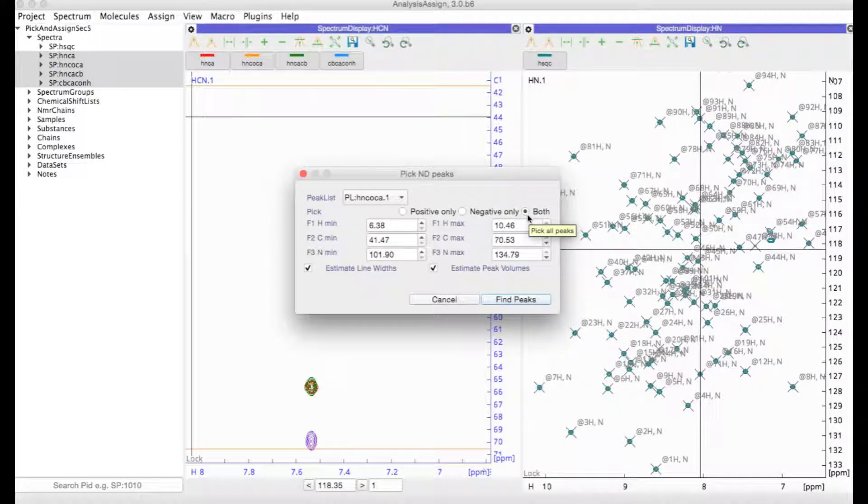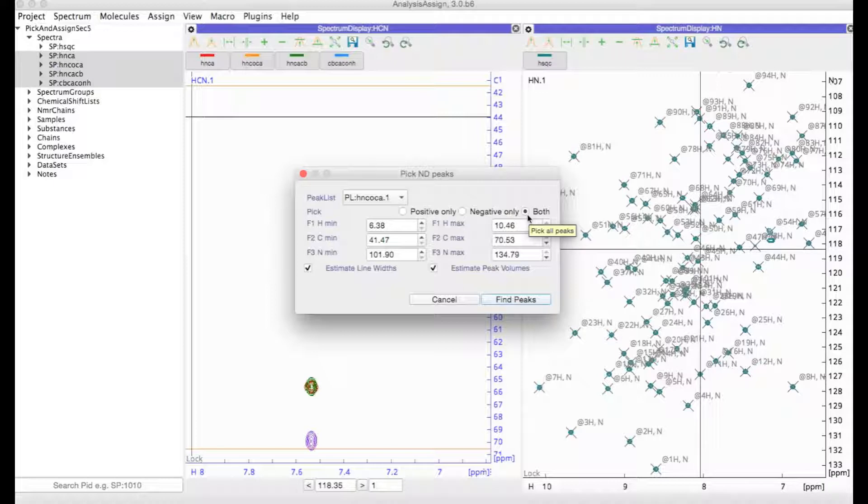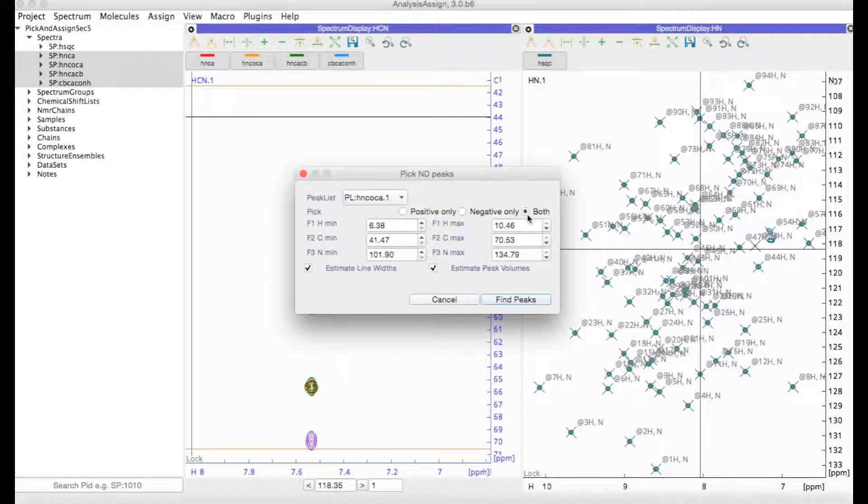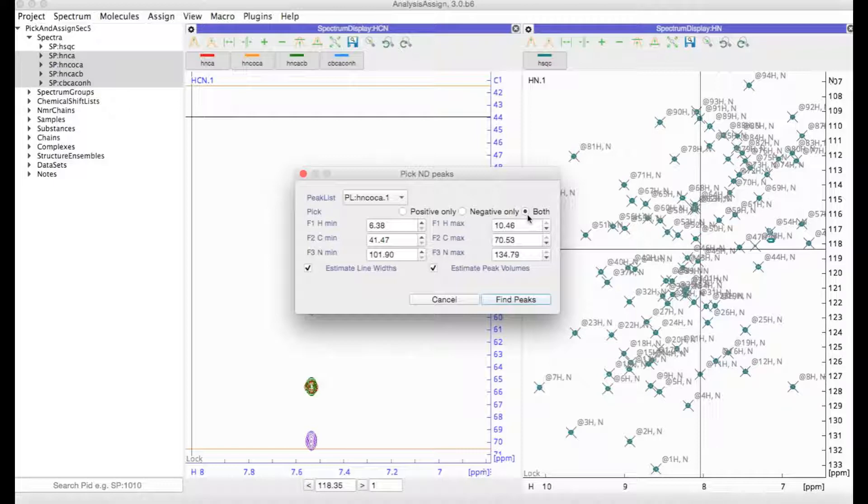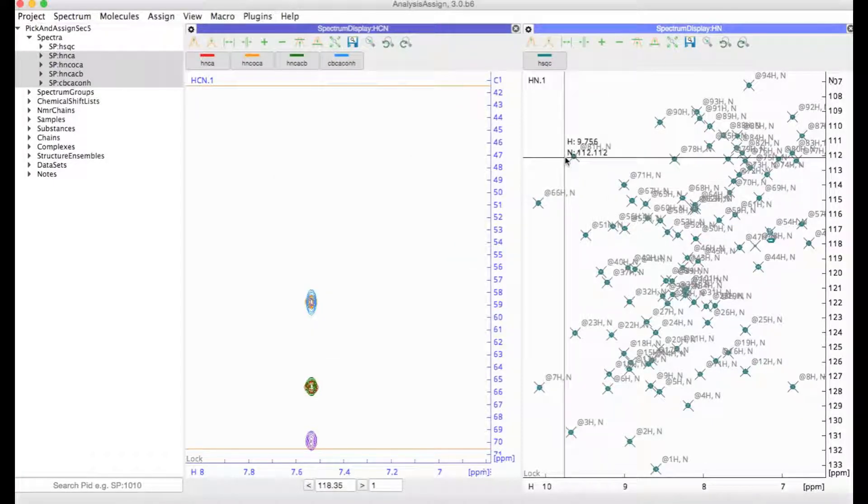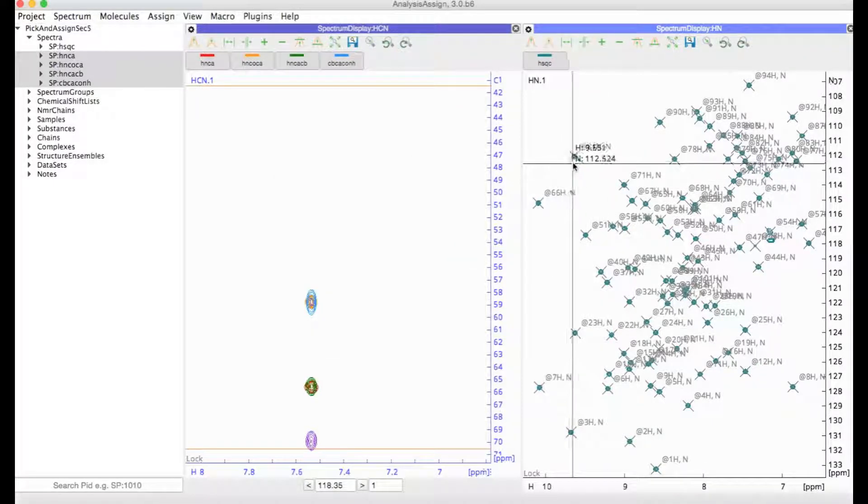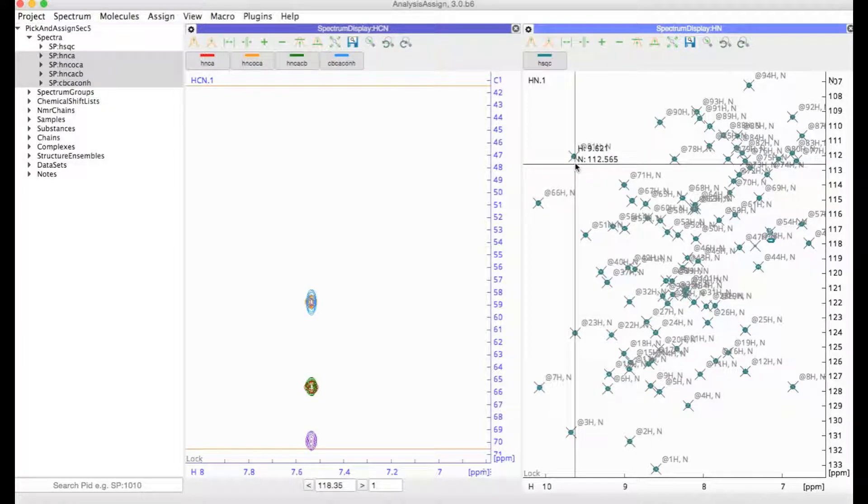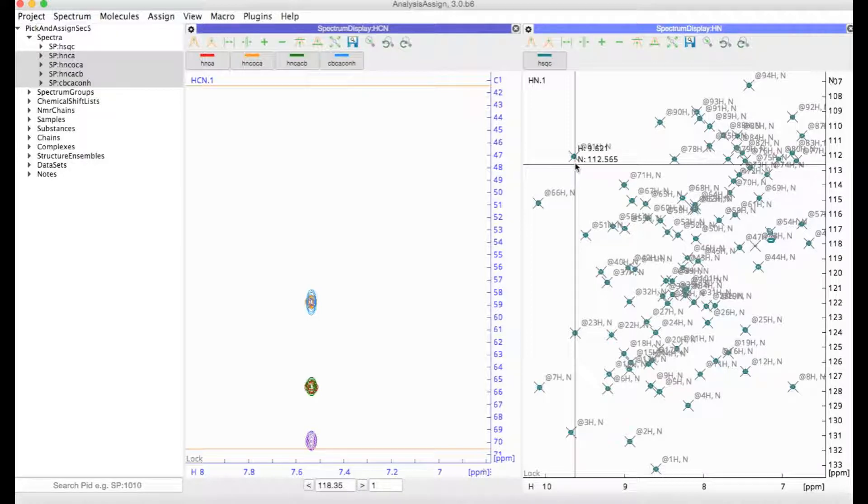The problem with this approach is that it will just pick a huge great area and could pick a whole load of noise peaks or artifact peaks, and you'd probably end up with quite messy peak lists. You also won't be transferring all the NMR atom assignments that you've made in your HSQC or base spectrum into the 3D peak list.